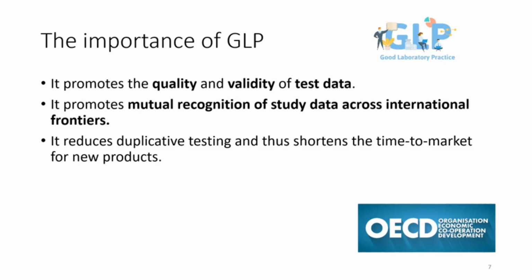Singapore has been adopting the GLP since 2007. So later on, some of you, when you go to laboratories for your internship, you might see that your laboratory has been GLP accredited. That means the laboratory has been following the OECD GLP principles.